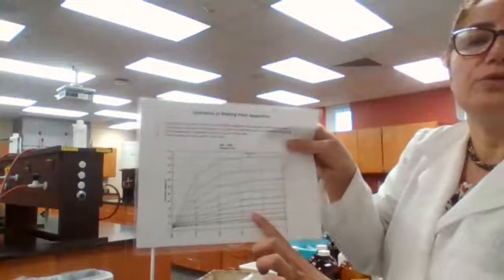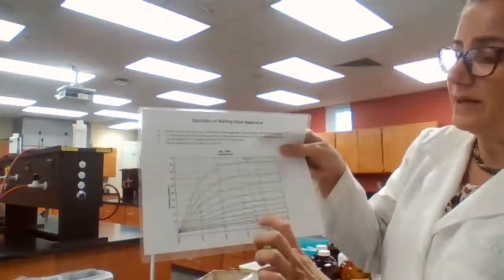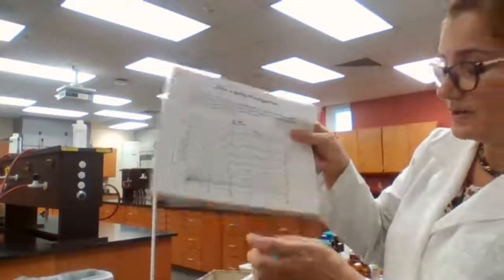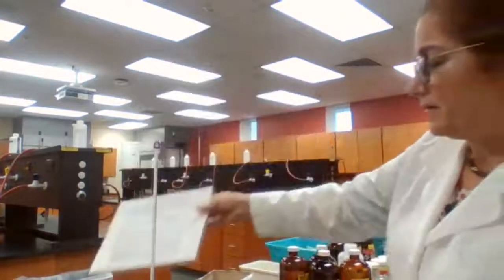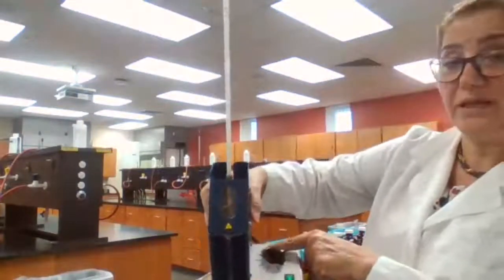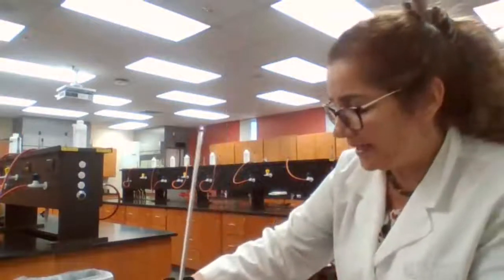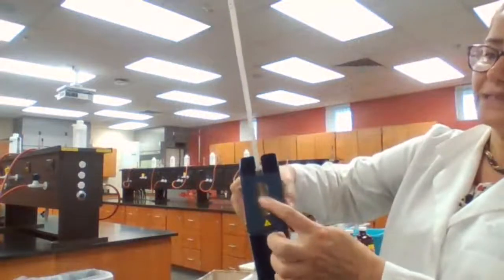So I'm going to use the setting three for my rate of heating. So this is going to be set at three because I want slow heating at this one. And we monitor and check through this eyepiece until the sample is melted.